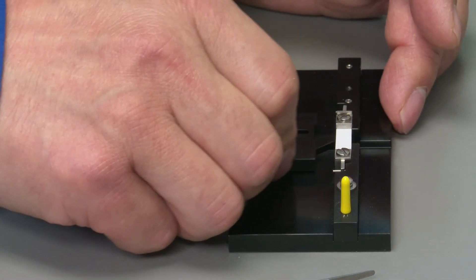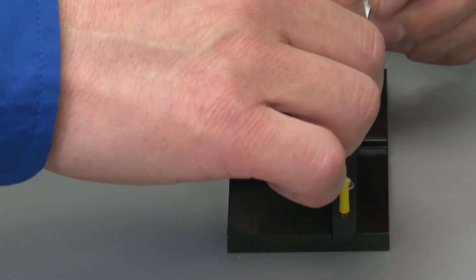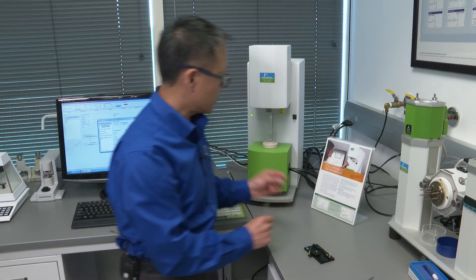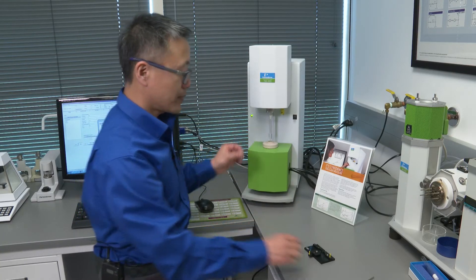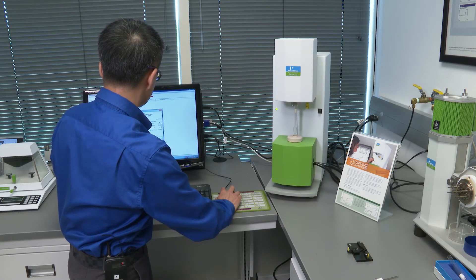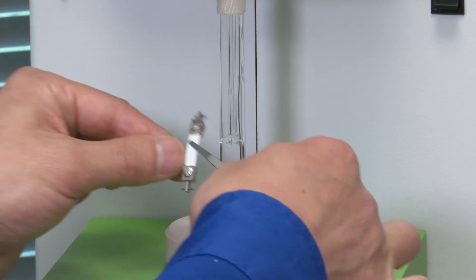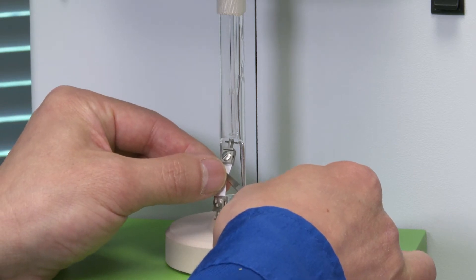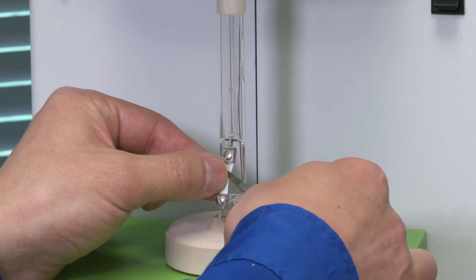Then you are ready to take this clamped sample out and load it into the TMA. You want to lower the probes and put the sample, the top part, the top clamp in the hook.